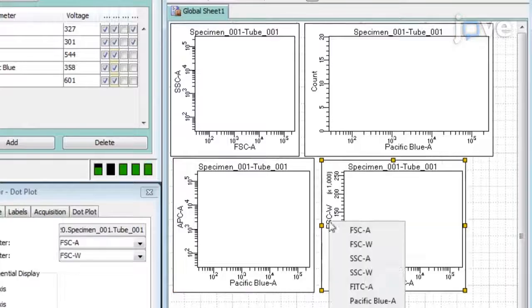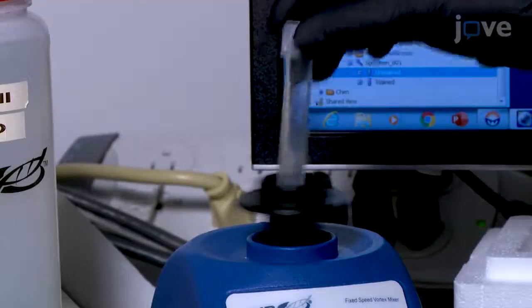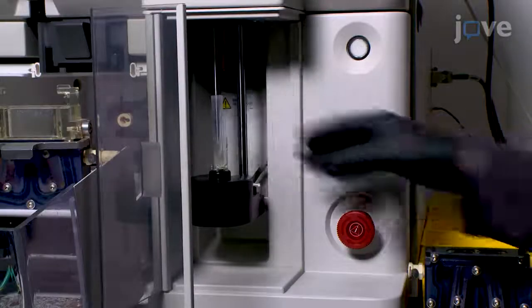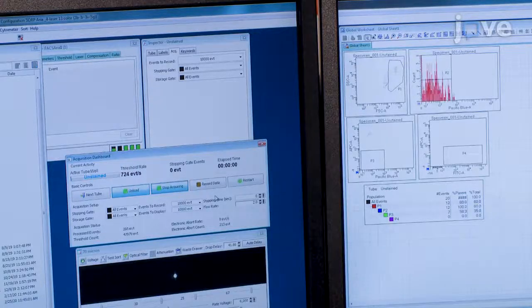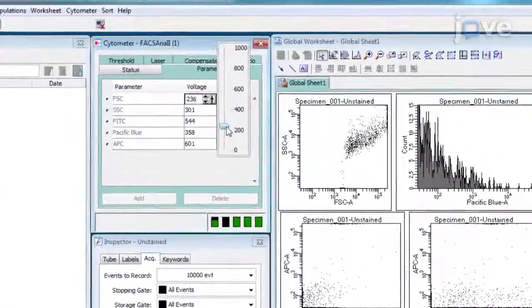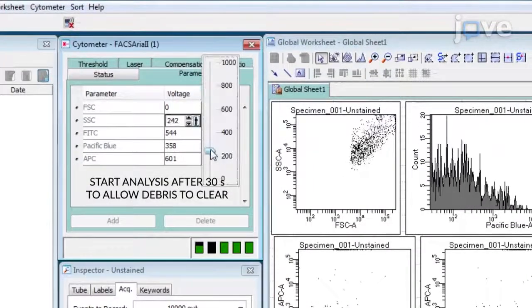For flow cytometric analysis and sorting of the live coral cells, load the control unstained cell sample into the sample chamber of the cytometer and start the reading process. Since coral cells are particularly fragile, keep the cytometer pressure low to prevent cell lysis. In the scatter plot, adjust the photomultiplier voltage to center the points and begin recording the events.